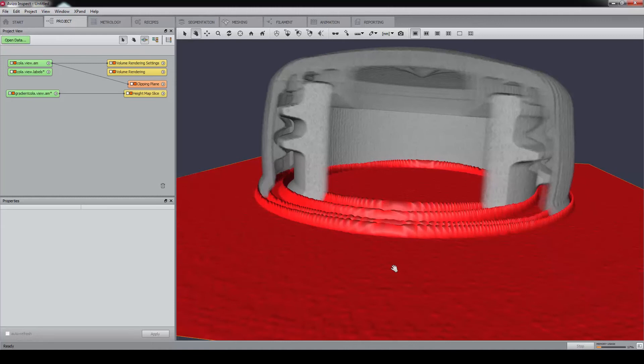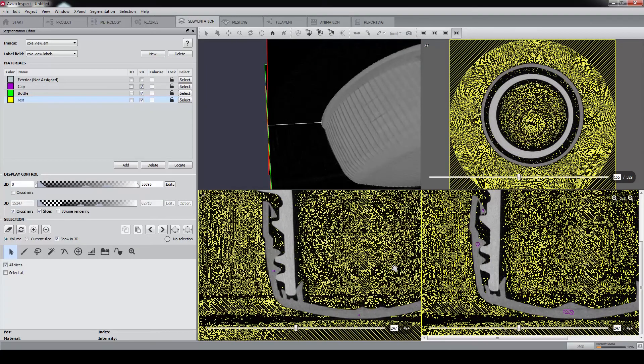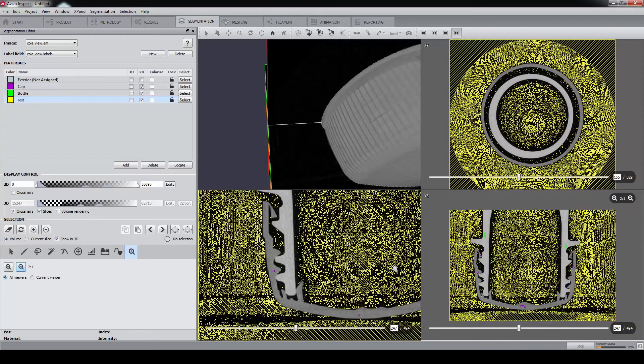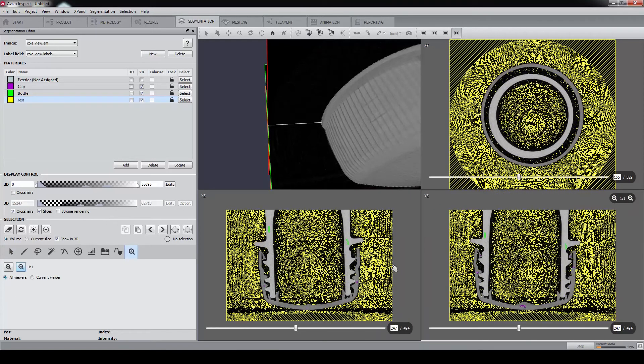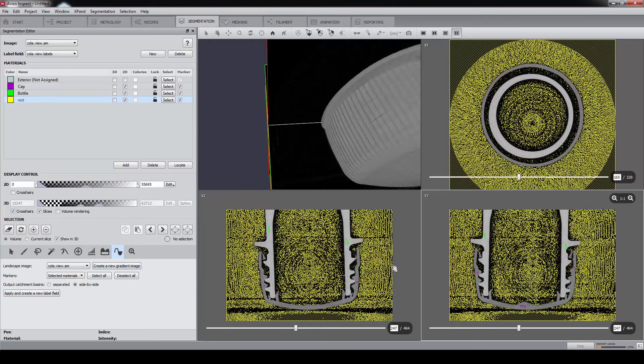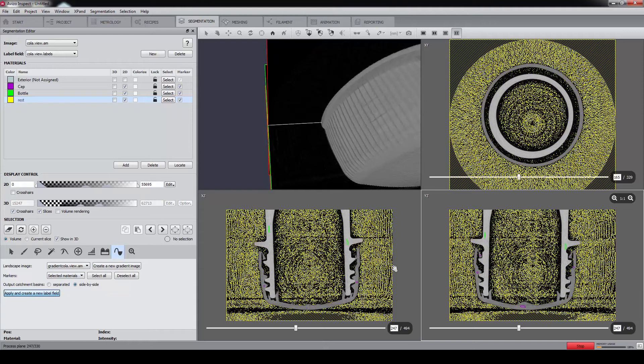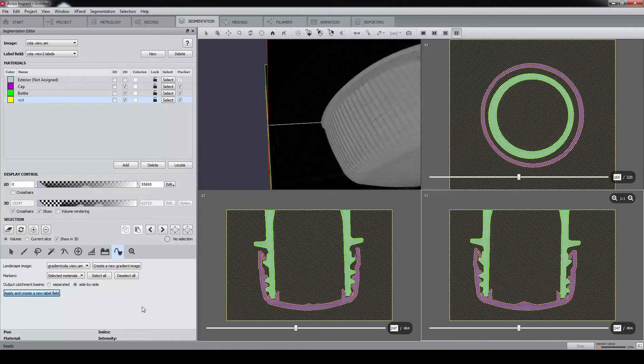Let's go back to the segmentation editor. Select the watershed tool again, and as we already computed it, select the gradient image as landscape image. Now we hit apply and create a new label field. You can see that we obtained a really robust and nice segmentation.